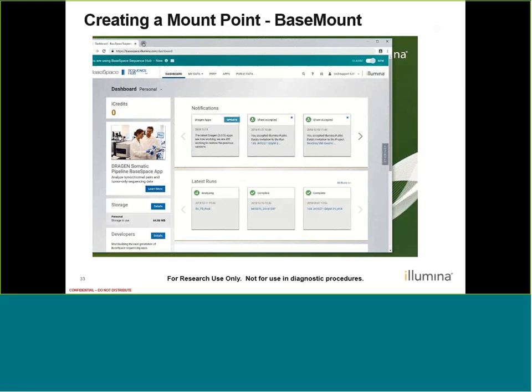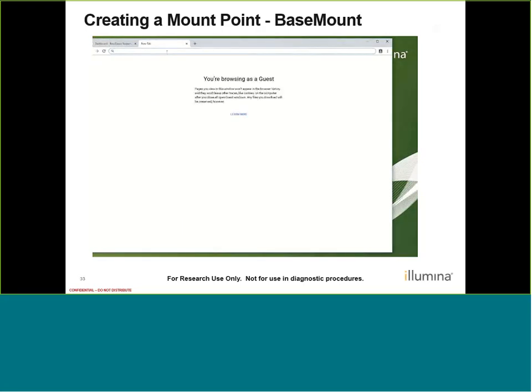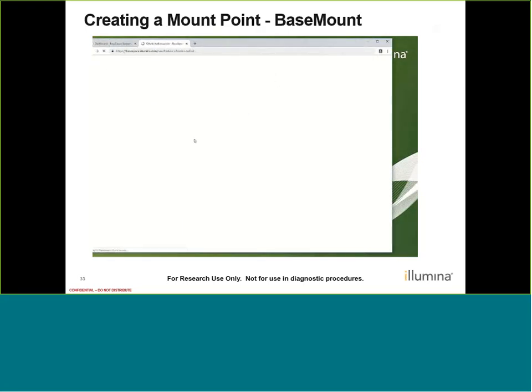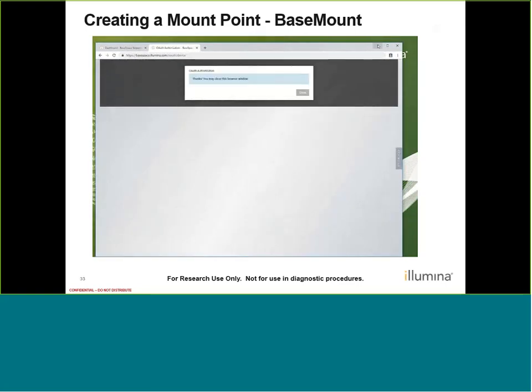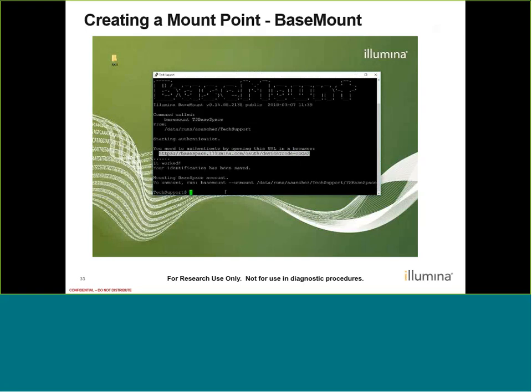Here I'm using PuTTY and I'm logged into my Linux server. I use the mkdir command and call it 'TSBaseSpace'. Then I type 'basemount TSBaseSpace' and it returns the BaseMount artwork along with the authentication URL that I can copy. Here I'm in my personal account — confirmed. I paste the URL just like we saw for CLI and accept. For BaseMount it says 'it worked and your identification has been saved.' Your mount point is now ready to go for your personal account.